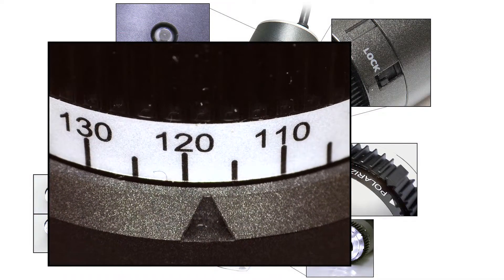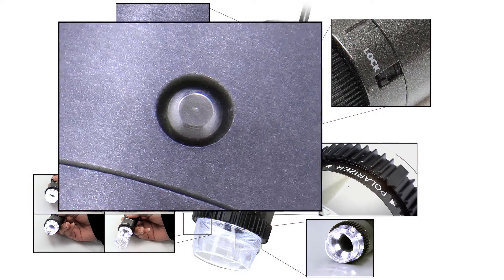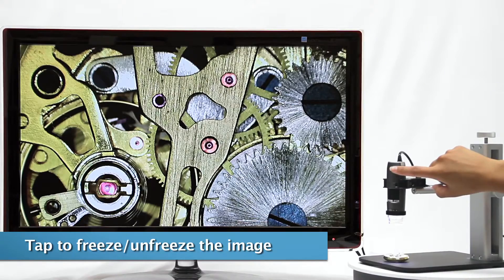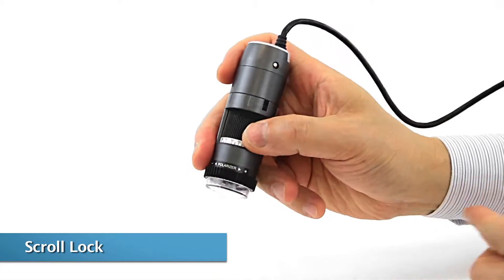The magnification dial is smooth and intuitive, allowing users to easily adjust the magnification power. The Microtouch also allows users to freeze the image on screen. The scroll lock allows users to secure the magnification dial in place.